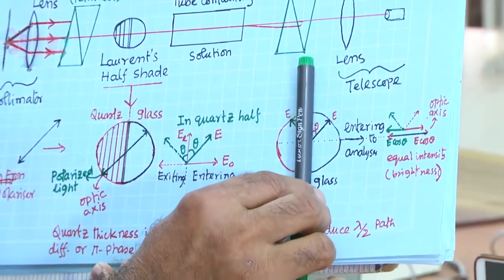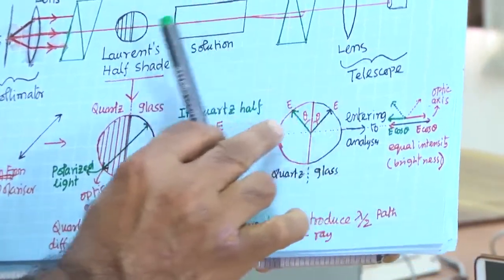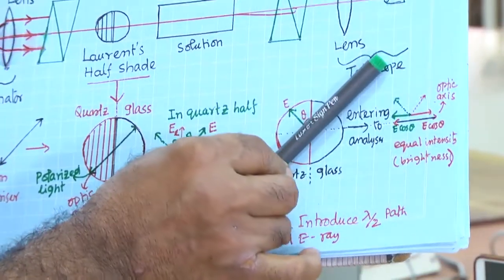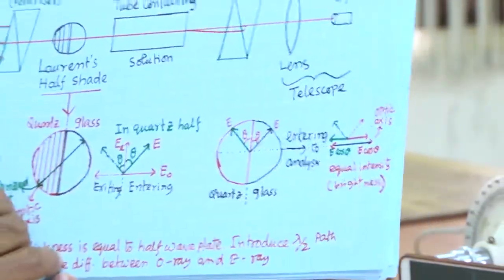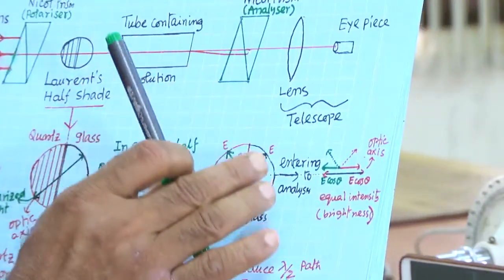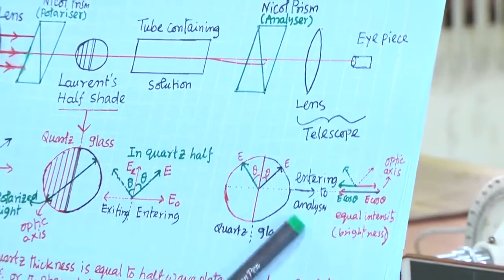Now, again I am continuing the change. So, the intensity will not be uniform. It will change when I am in this direction. It is basically 90 degrees from this, where we got both halves equal. One half was dark and one half bright. So, now just one half will be dark, one half will be bright. So, it is the opposite direction.